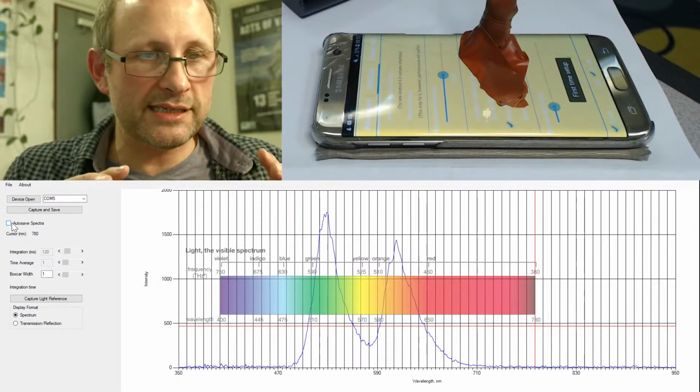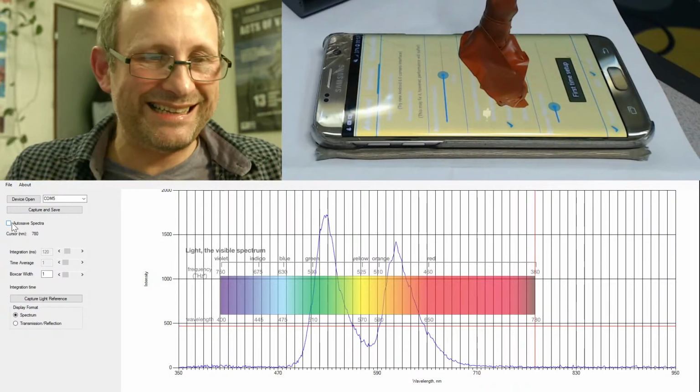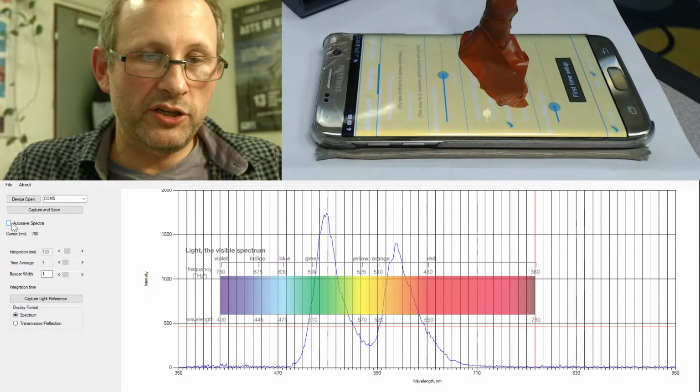This is quite good because it's just a standard CSV file, and you can concatenate those with the timestamps, and you would have a data feed.